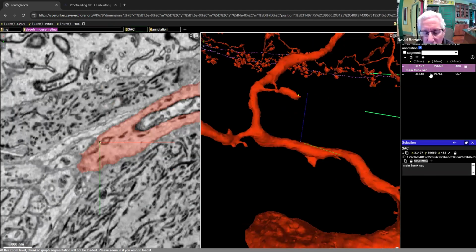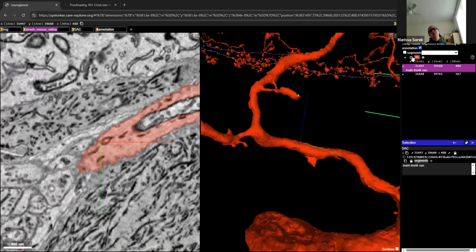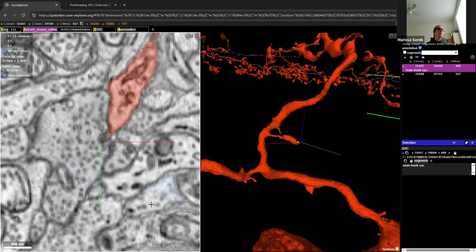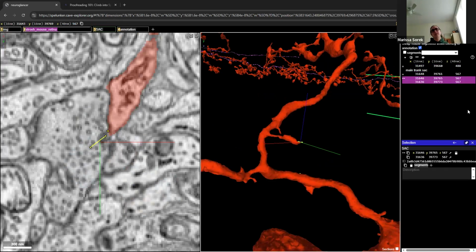And jump. Okay. As I said at the beginning, if it's not working, try right clicking. And that actually brings me to the other types of annotations you can create. There's bounding boxes. There's also these annotate lines, which are helpful if we want to maybe put a pre and post here. So we could put it in one spot and then say it's going to this other spot.